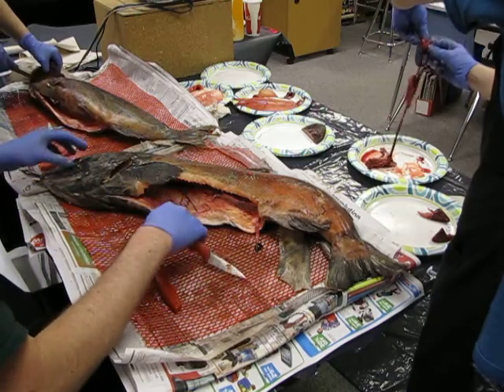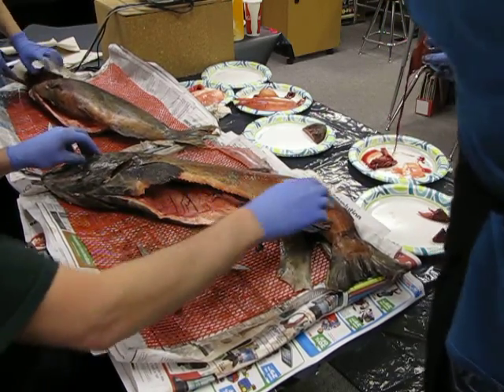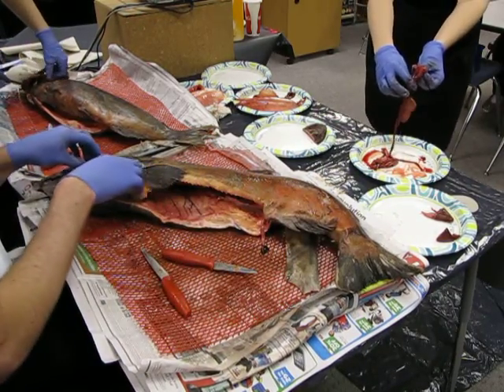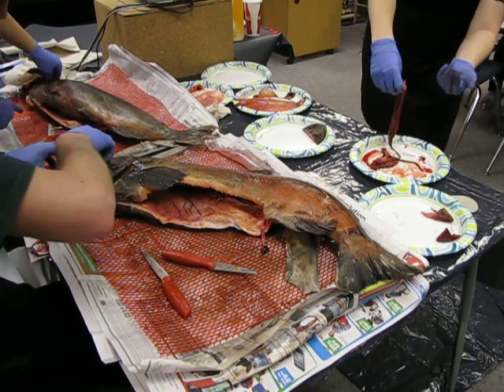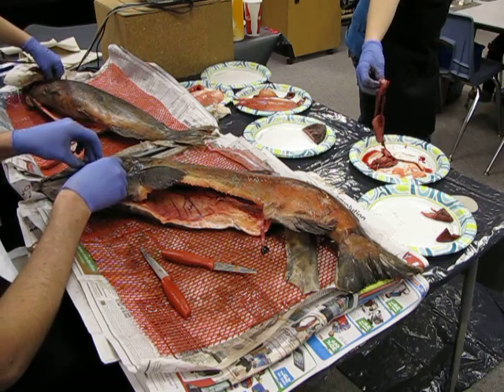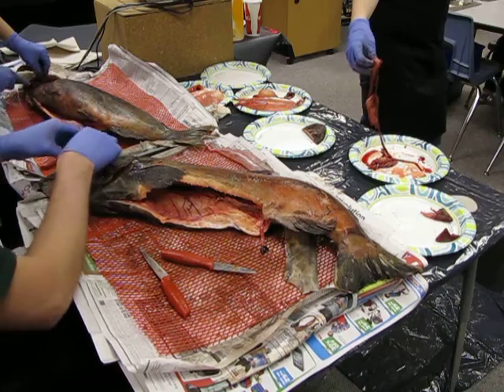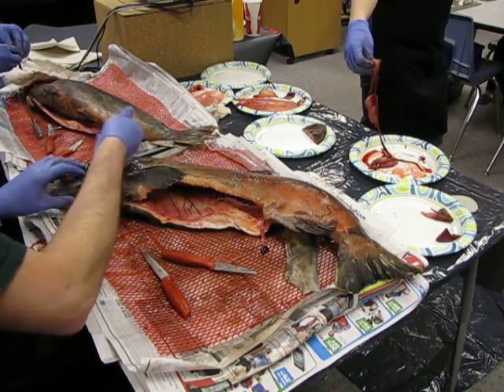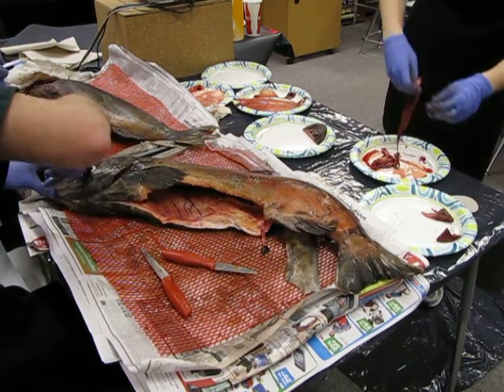So this tube right here is the salmon's stomach. I have my finger in it. Just the top part is the stomach, okay? Now, this tube is empty. There's nothing in it. Why is it empty? Because it doesn't have any food. Exactly. Why doesn't it have food? It hasn't eaten. Exactly. We talked about this. They're spawning salmon, so it hasn't eaten in a really long time. So the stomach is empty.